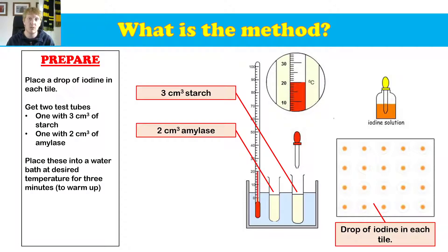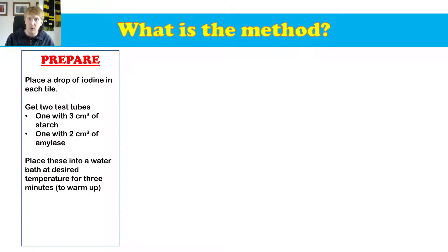And we're going to put both of these into a water bath at whatever temperature we're interested in. Let's start with 20 degrees Celsius. So both of those solutions are going to be there for about three minutes to warm up to 20 degrees. And that's the water bath.